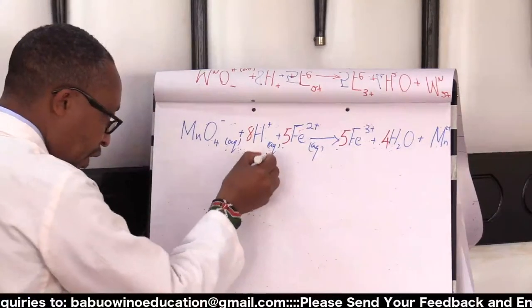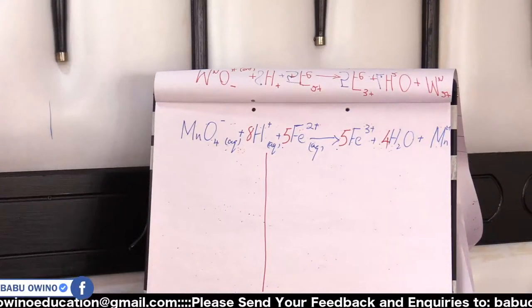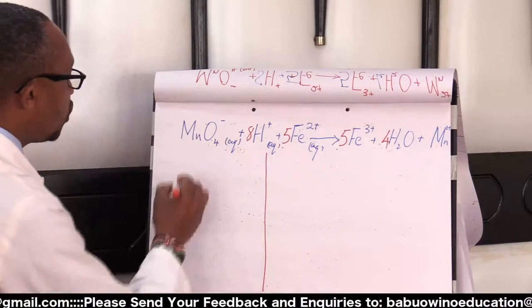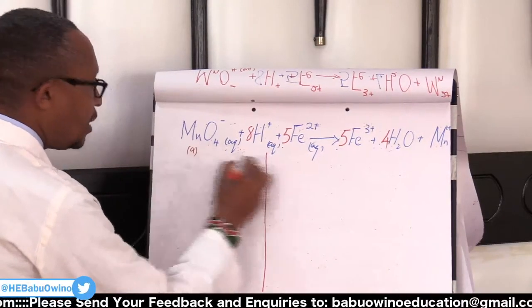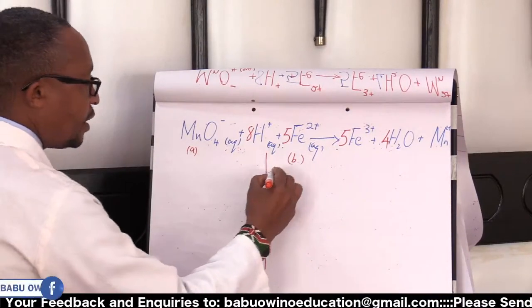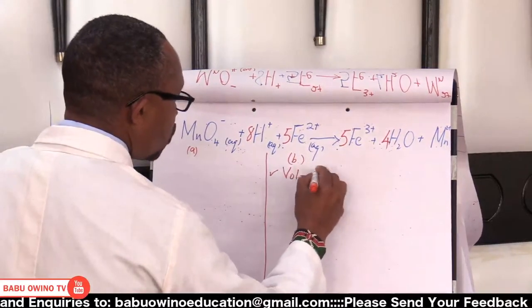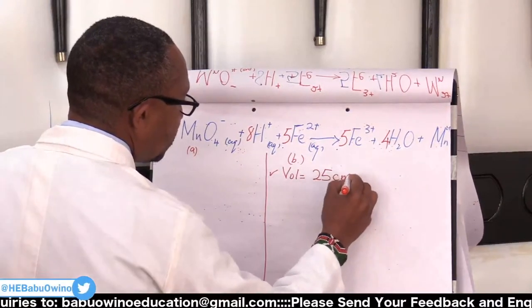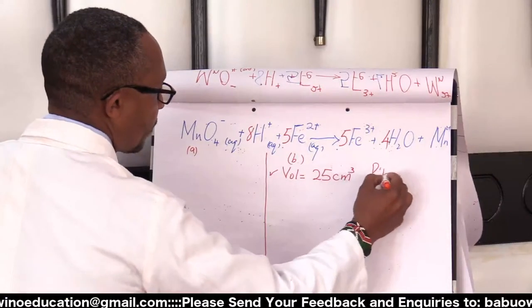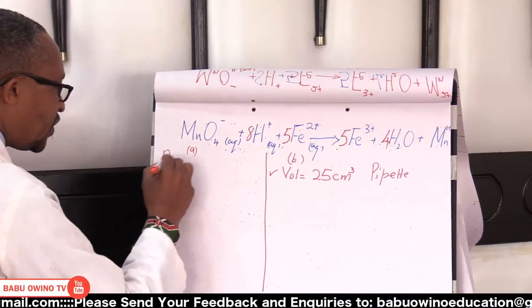So we now put our line here. You don't have to worry. In these questions, the exercise is the same. Very simple. So this could be a solution A. This could be a solution B. Here we have discovered that the volume was 25 cubic centimeters from the pipette. This is the pipette. Here, this is the average volume, because this is the burette.